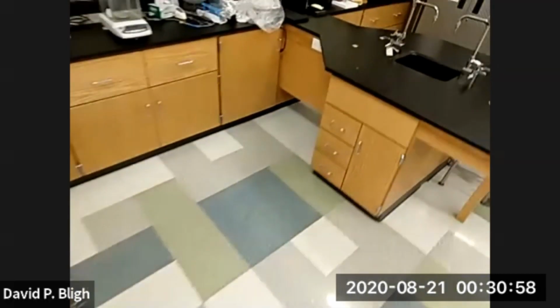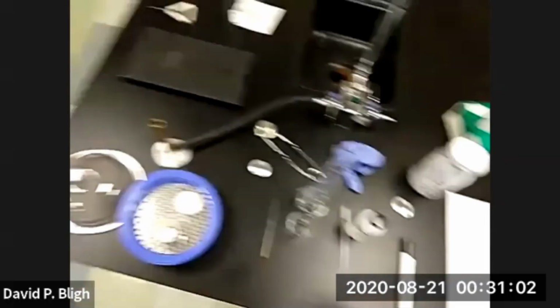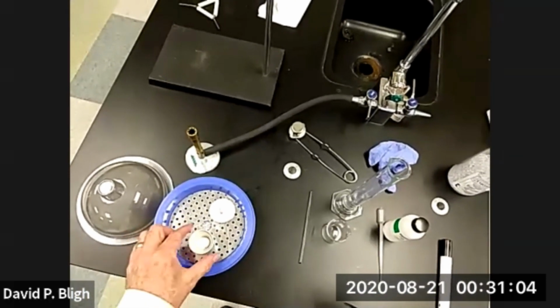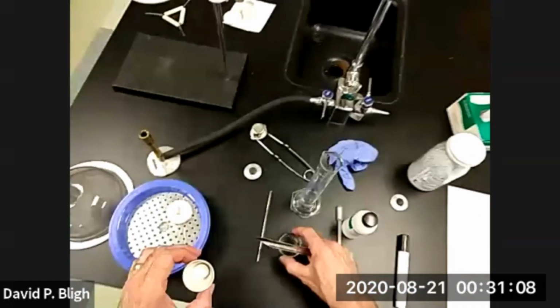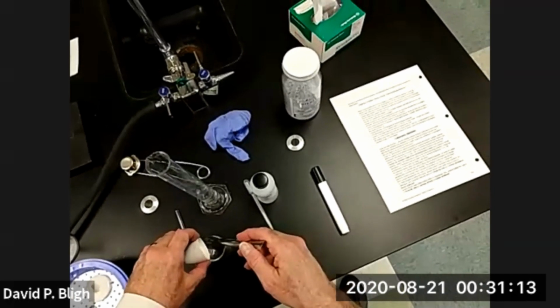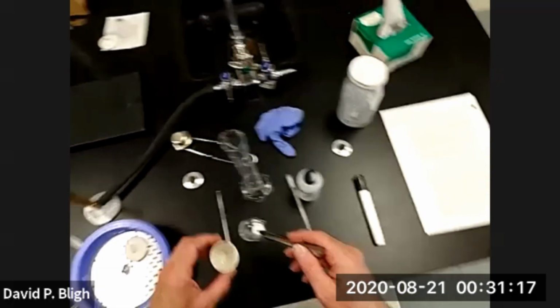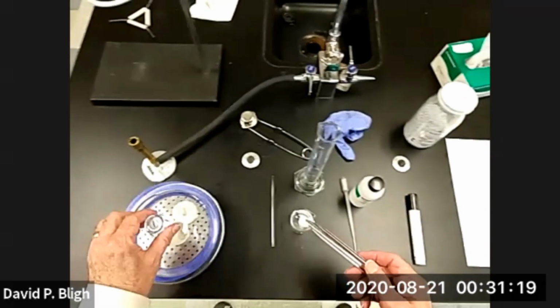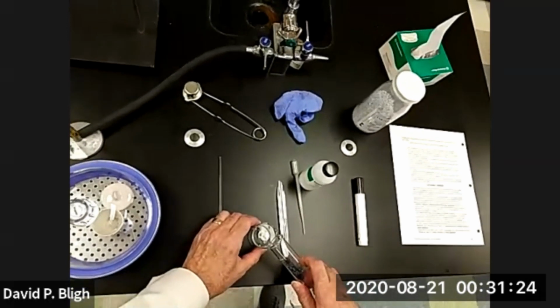Let's see. Spatula. I got one right here in my pocket. Okay, we're going to transfer. That's easy to handle. Fingerprints don't matter now because we're not going to weigh it anymore. So let's transfer that. There we go. And let's put our 30 milliliters of water in there. Dissolve it.